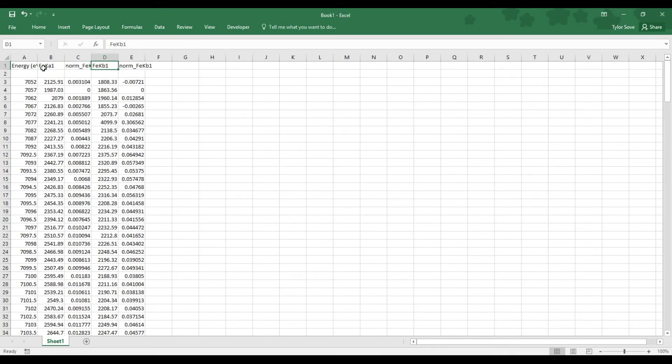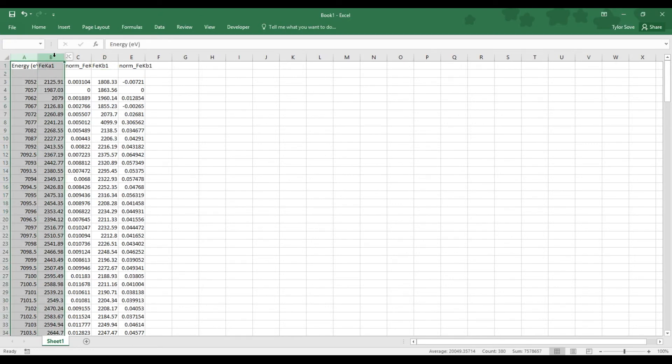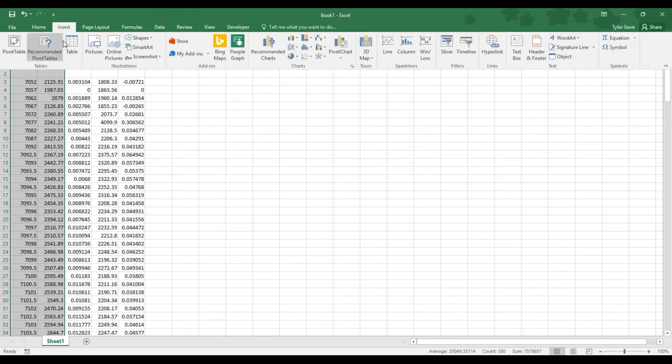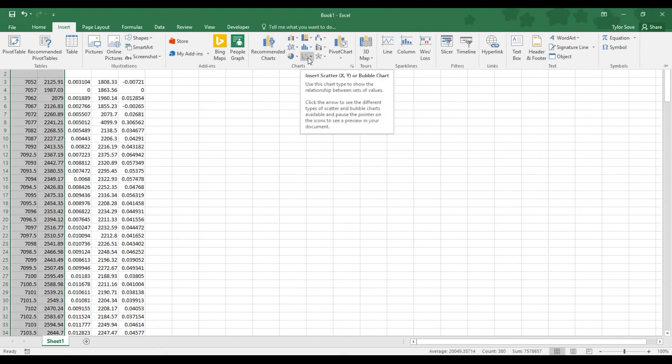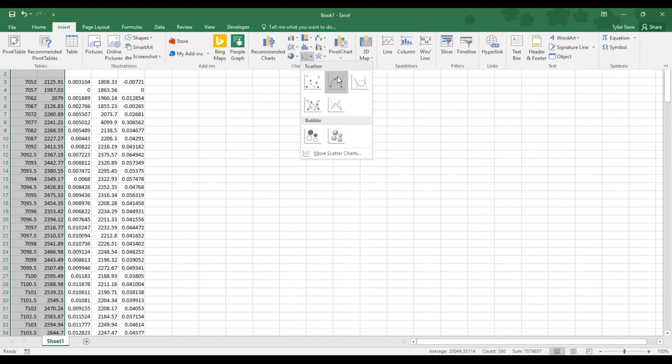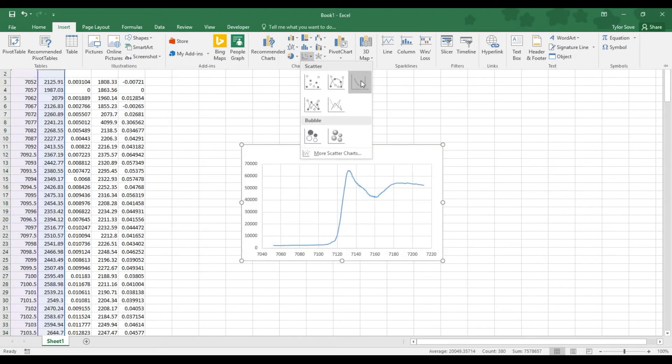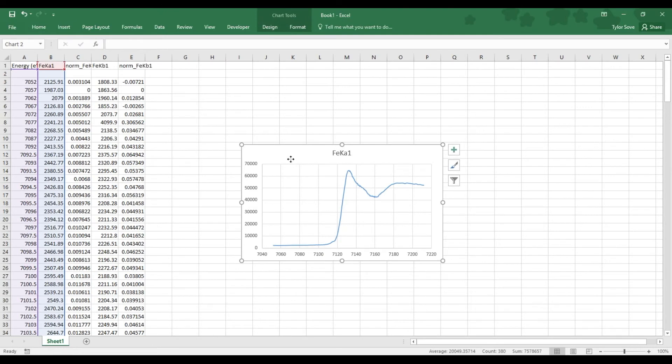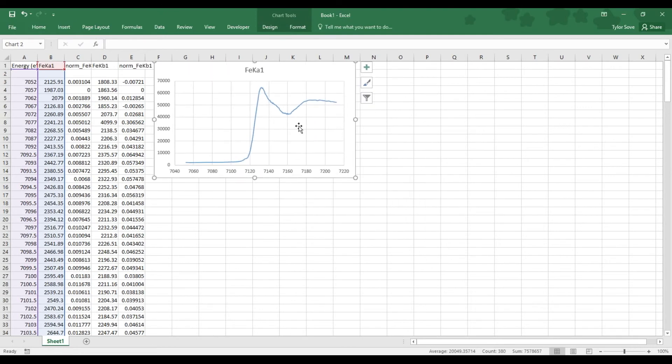And so to graph these, select Column Header A, hold Shift as you select Column Header B, go to the Insert tab, go over here to the drop-down menu for the charts, and select the Scatter with Smooth Lines option. And here we go.